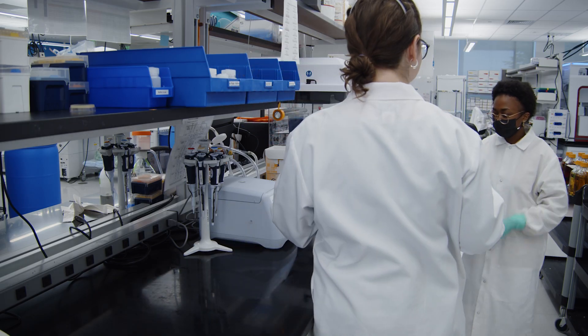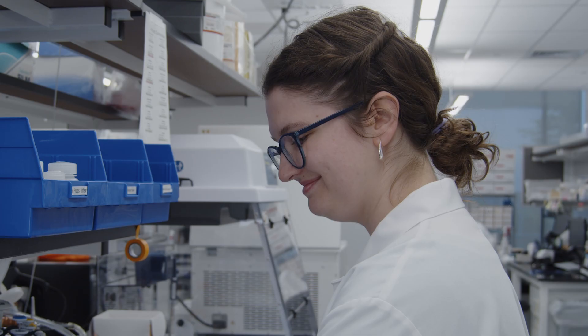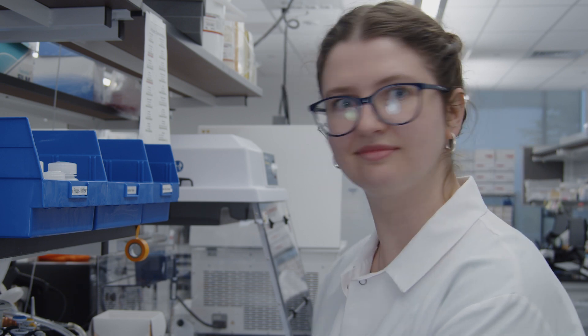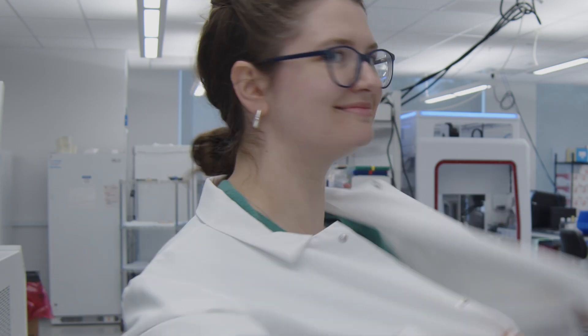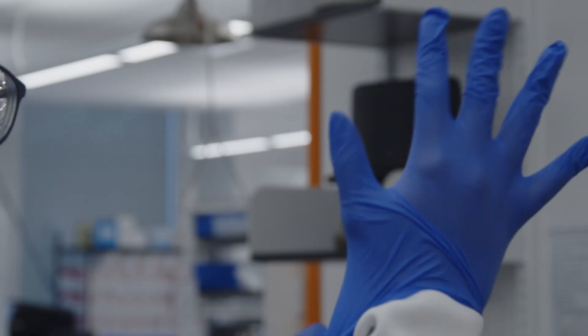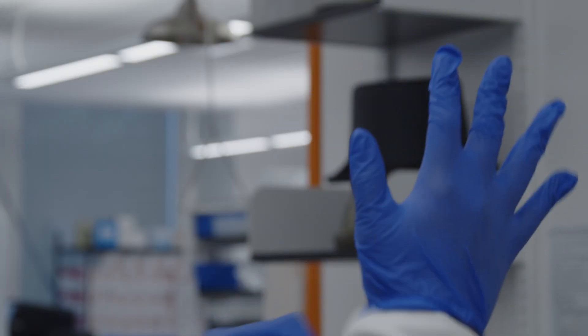So, how do you get the clean that's the envy of the lab? First, remember that sterile technique starts with you. Your lab coat and gloves don't just protect you. They also protect your samples from the contamination you bring into the lab.